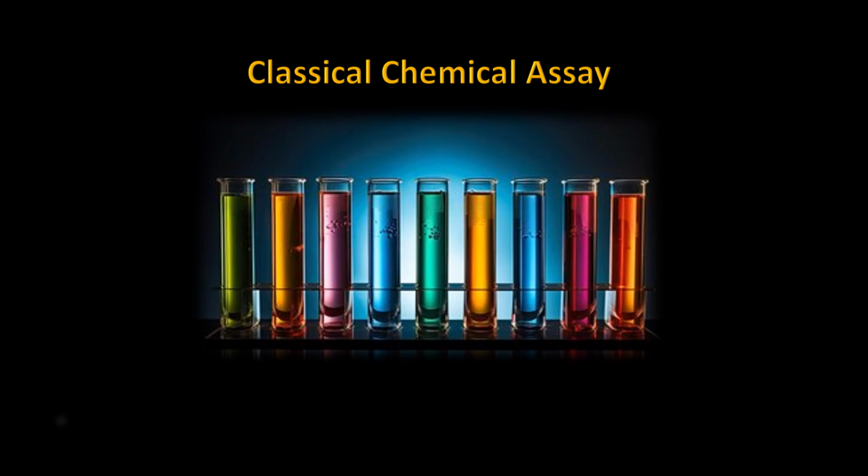Most textbooks, if not all, refer to these methods still being used today as some of the oldest, and because of this fact, it has been termed classical assay. Therefore, I have decided to call this series Classical Chemical Assay for Small Miners, Prospectors, and Hobbyists.